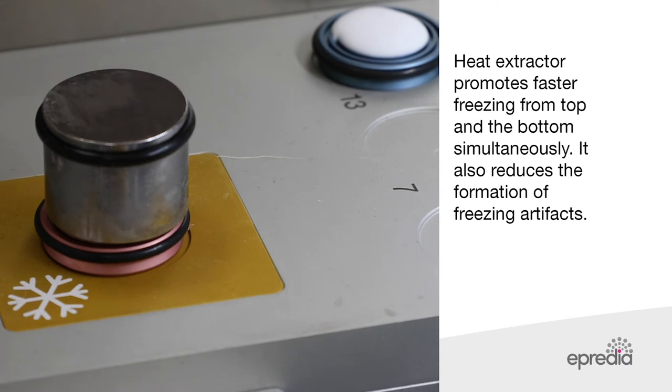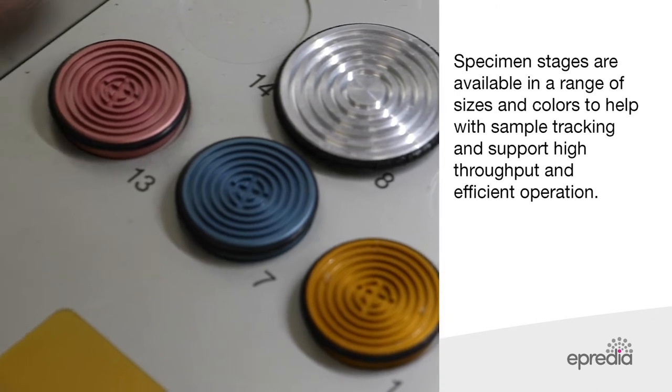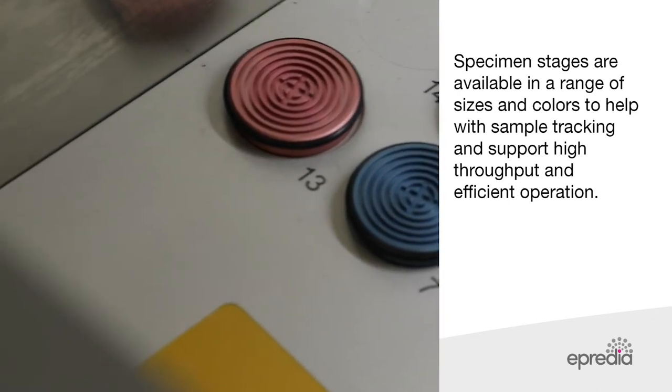The heat extractor also reduces the formation of freezing artifacts. A range of specimen stages are available in different sizes and colors to help with sample tracking and support high throughput and efficient operation.